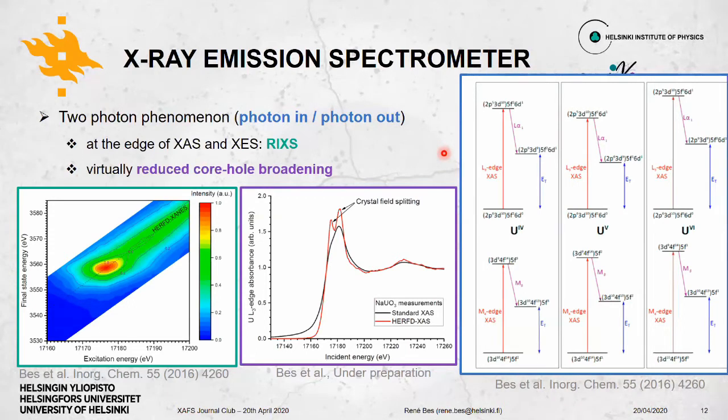So in this slide, it looks like you're using the M-line emission. Yes, that's true. It's the M-line emission we are using in this slide. And that would be a good reason for using the M, even if it might be less sensitive and less signal.